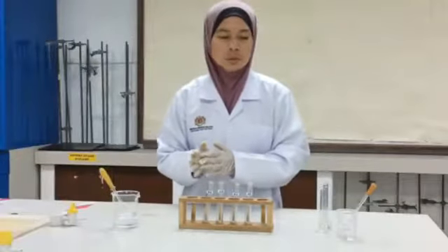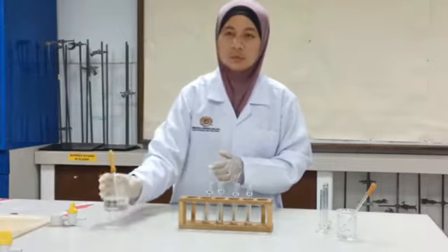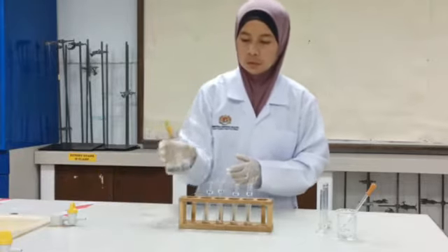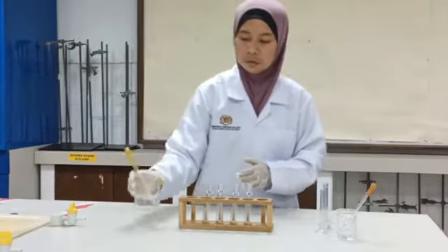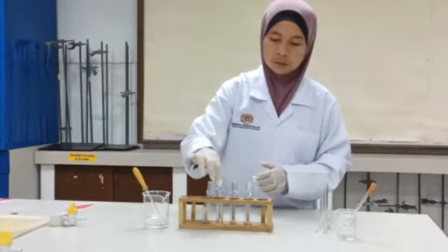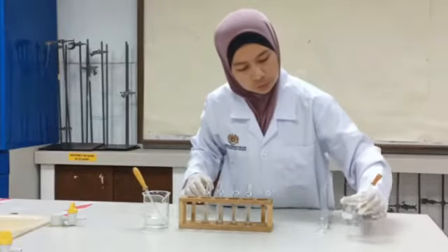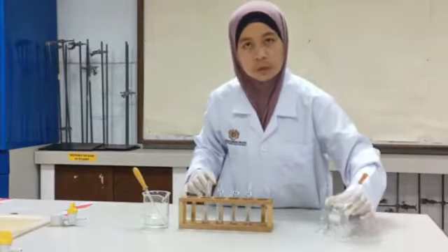Now we will do the test for chloride ion. We need excess nitric acid, 2 mole dm³, for salts A, B, C, and D. Here we also need silver nitrate, 0.1 mole dm³.